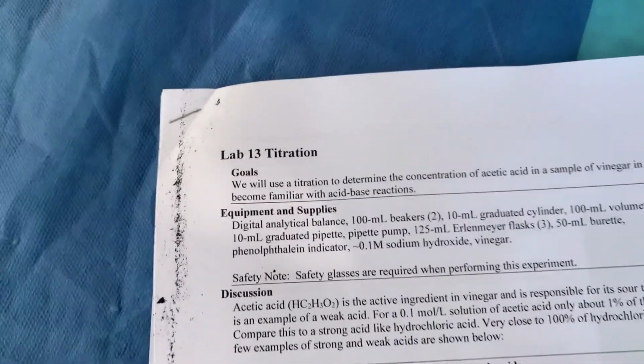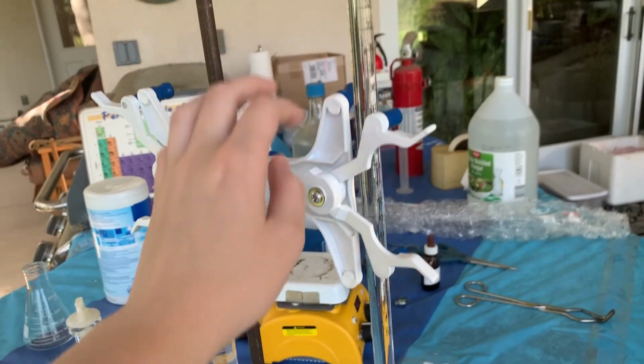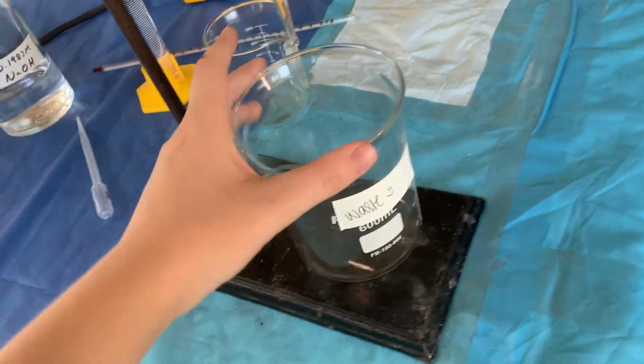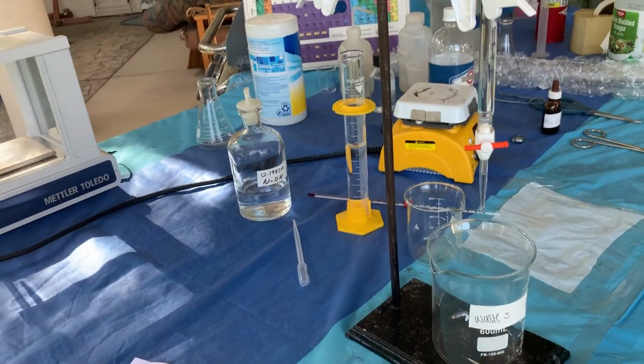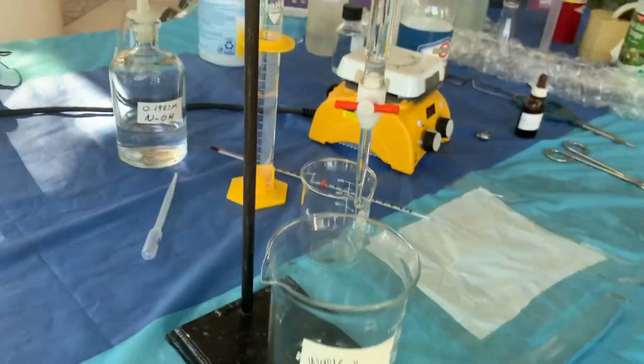The lab 13 titration. So first you're going to set up your apparatus with your ring stand, your burette clamp, your burette that you grab from the lab, and a beaker. We have a waste beaker, and eventually we'll have sodium hydroxide and acetic acid, or vinegar.